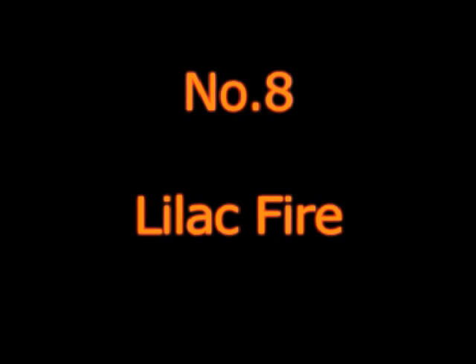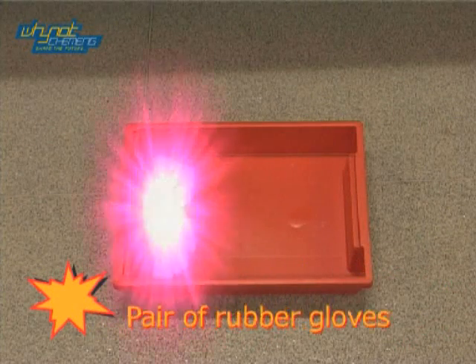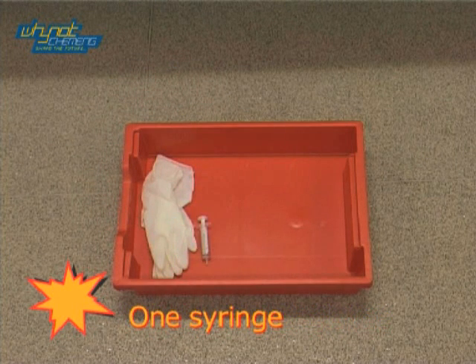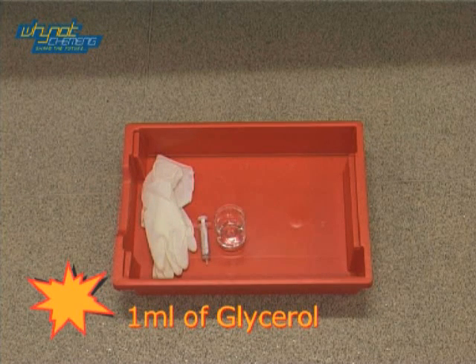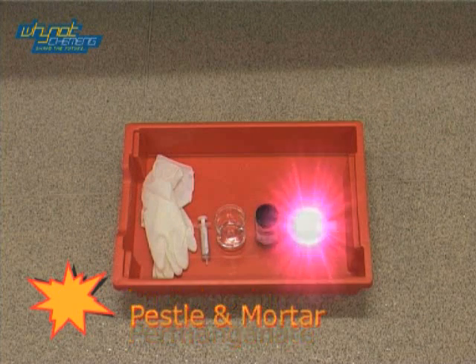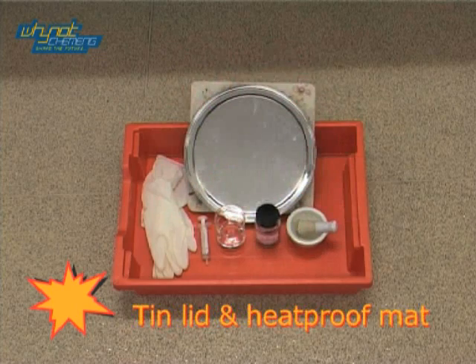Number 8 on our Top 10 list is Lilac Fire. For this demonstration you will need a pair of rubber gloves, one syringe, glycerol, three grams of potassium permanganate, distilled water, and a tin lid and heat proof mat.